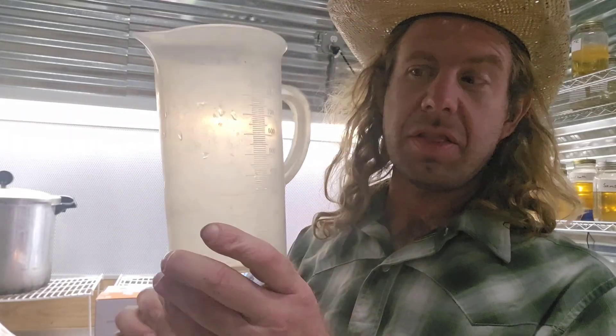Number nine: polypropylene cups. These are autoclavable pitchers — 1000 milliliters — and this is actually what I like to sterilize my agar in. Some guys like flasks, but I prefer these polypropylene cups. Number nine: polypropylene cups.